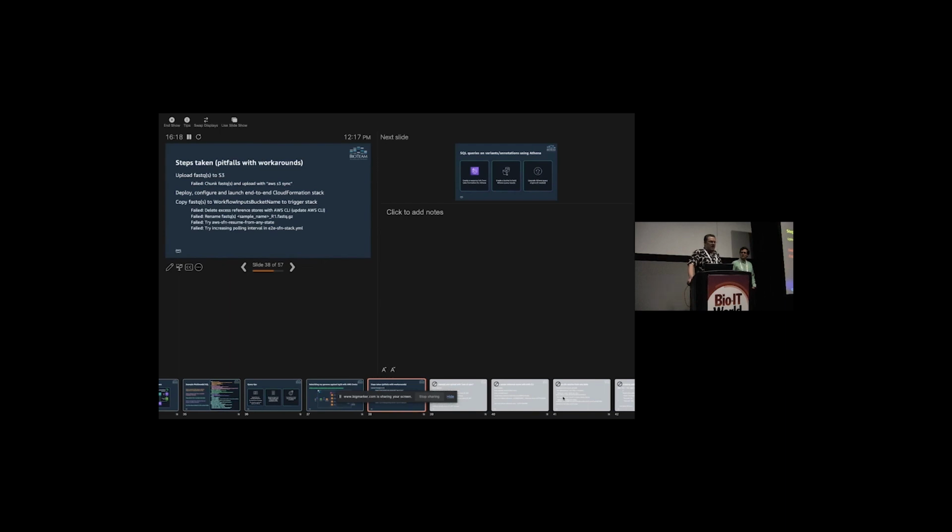Then the third thing I ran into was the number of state transitions. As it's going through this big workflow, it's constantly polling, and every 30 seconds it was checking on something. But it ran long enough that I hit the maximum threshold of state transitions, which I think was like 30,000. So then I tried to use this other GitHub repo put out by AWS, this resume from any state, thinking I could pick up where I left off. It works for certain kinds of failures, but not for a exceeding-a-threshold sort of failure.